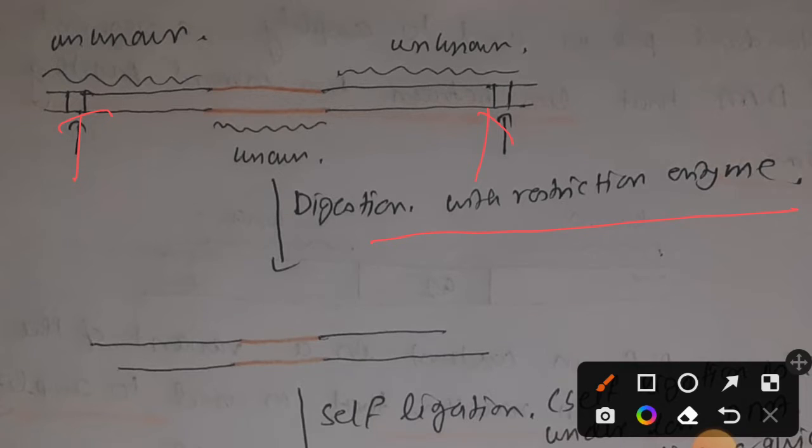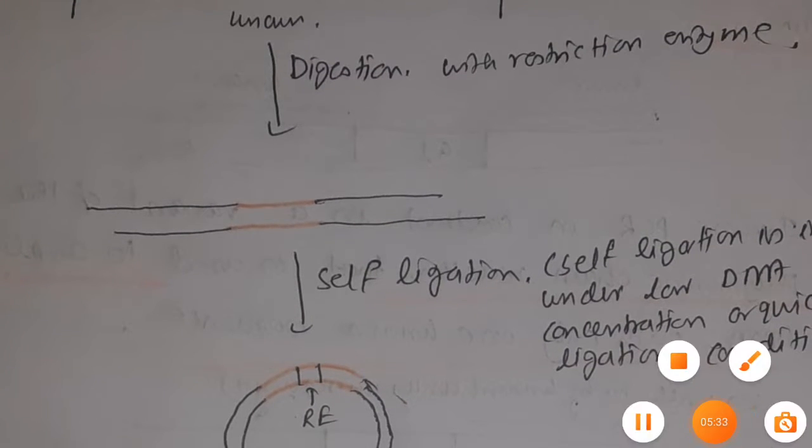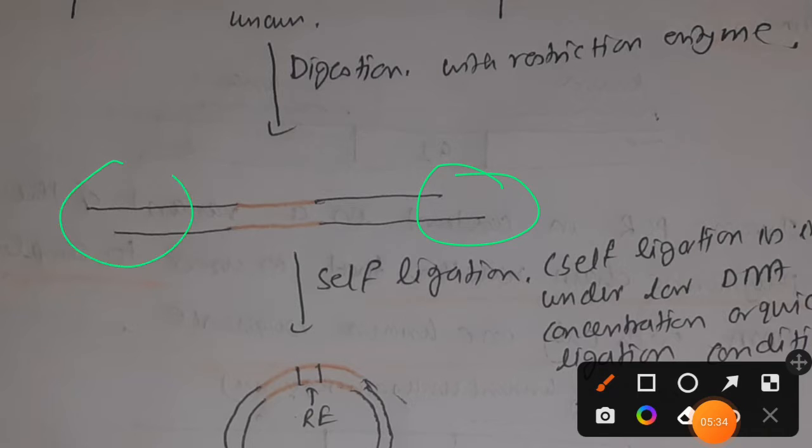That means, suppose up to that part we want to sequence, then the DNA fragments outside the sequence of our interest should be chosen for the restriction digestion. So after the digestion there will be a staggered cut for you.